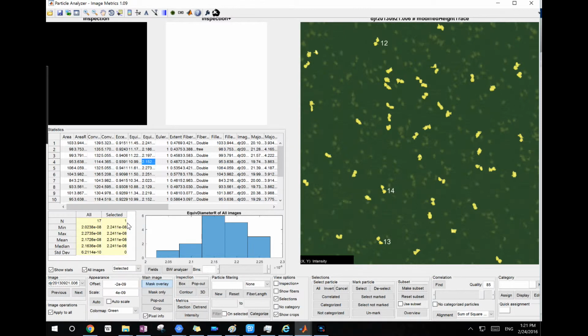So right now I have 17 particles. This is a small selection. In my experience, anything below 100 is fine. But anything above 100 will be overwhelming for both the system and yourself in the manual review process. Now let's go to the manual refine process, which is to align these particles, and then we can make our decision which one is a true match and which ones are false positives.